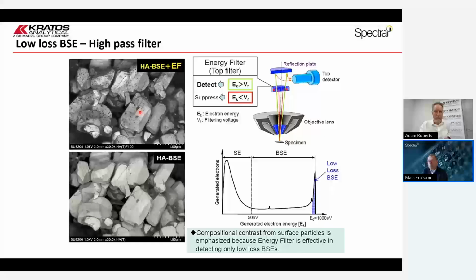Of course, we don't know what it is. Especially in the SEM, it is probably an organic contaminant on that surface. We can see it's dark, so it's probably mainly hydrocarbons. But what it is is hard to tell, and that brings us over to the next really nice capability of the XPS.